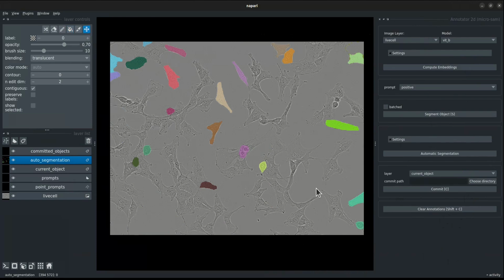We also observed that there are some larger structures which were incorrectly segmented. Let's go ahead and remove those segmentations. One of the other structures as well, and another background which we missed. We would use prompt-based segmentations to add segmentations for these missed out objects.